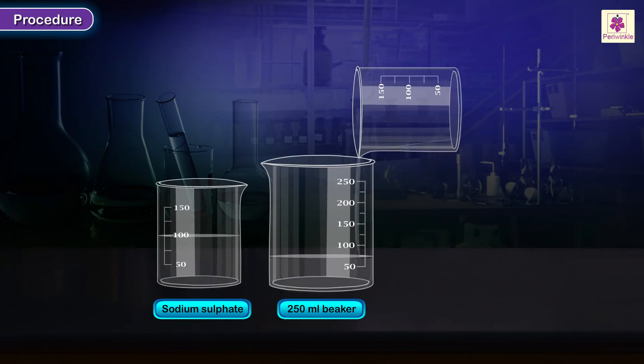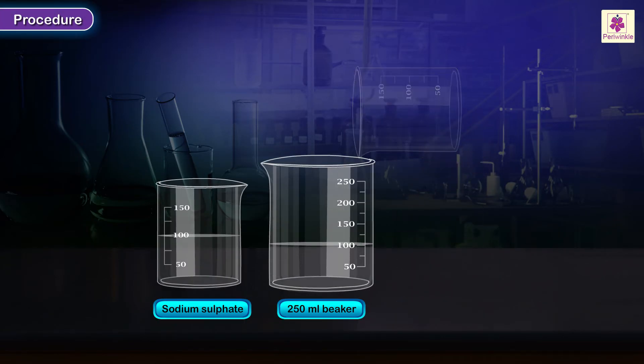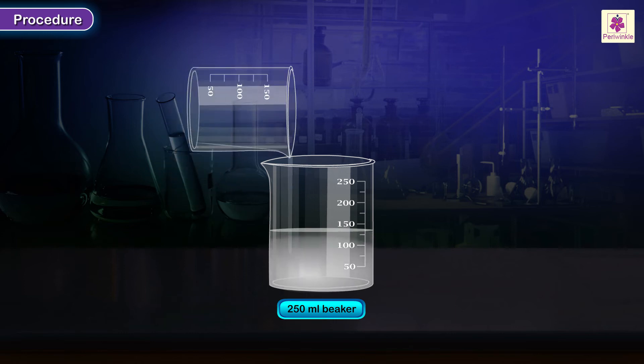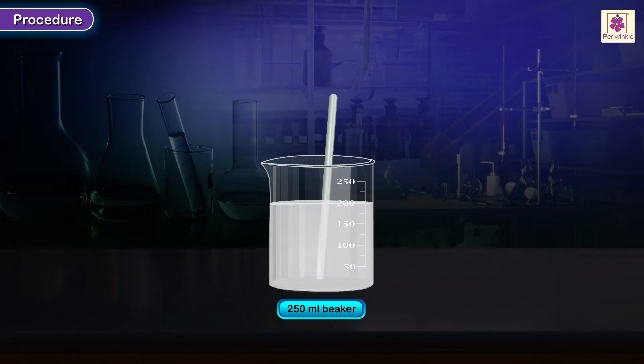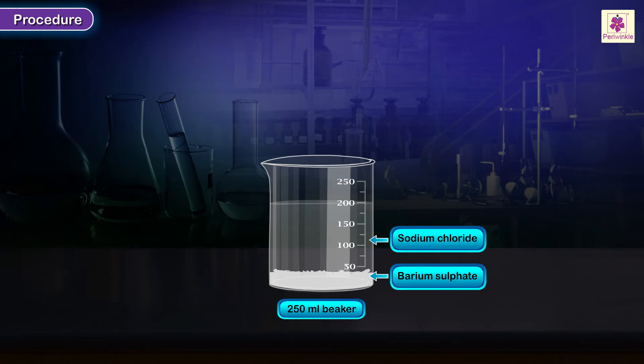Mix the barium chloride solution and the sodium sulphate solution in this beaker. Stir the contents using a glass stirrer. A white precipitate of barium sulphate will be formed as a result of precipitation reaction.